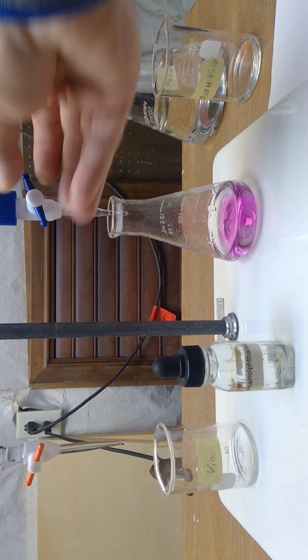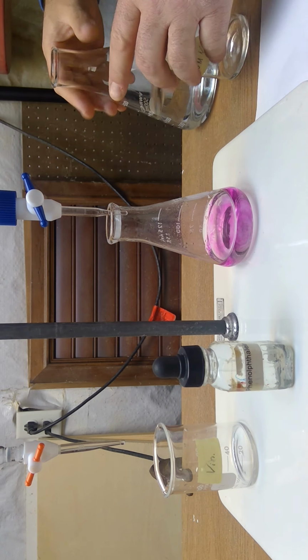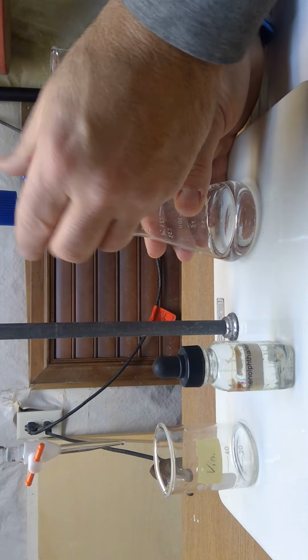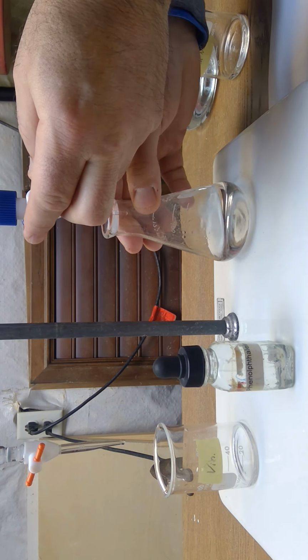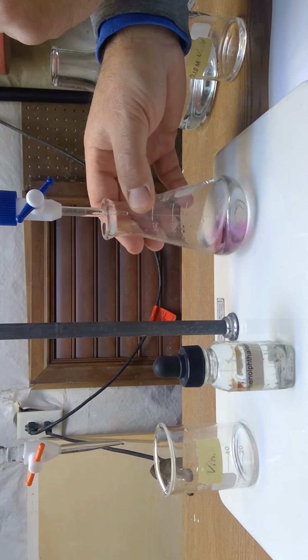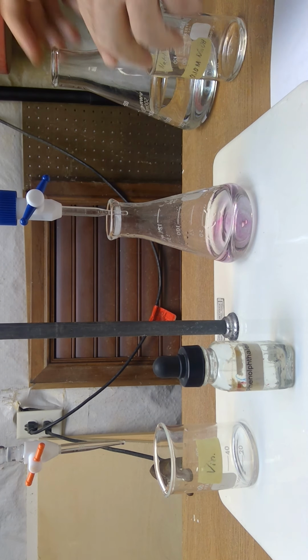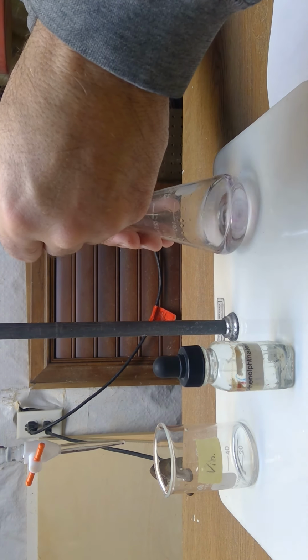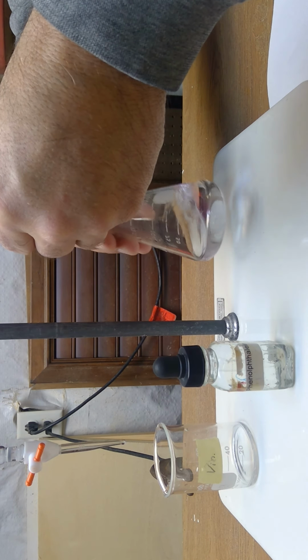We should slow down. So let's slow that down. We'll get this stirred. Okay, we're in pretty good shape here. So let's go ahead and keep the titration going. And we're just about to 40. So we're going to slow this down to drip by drip.